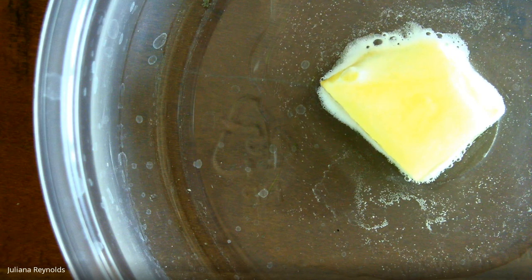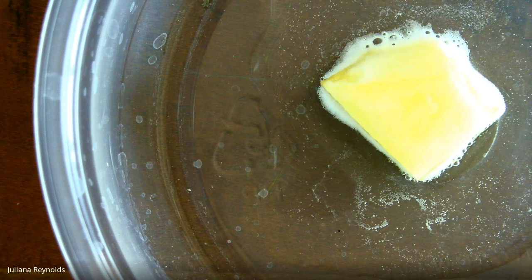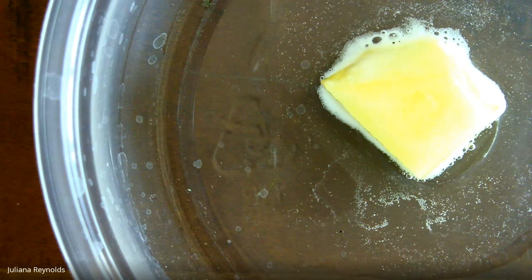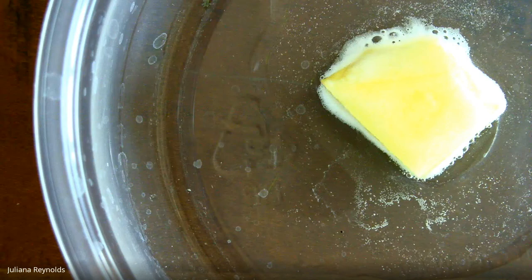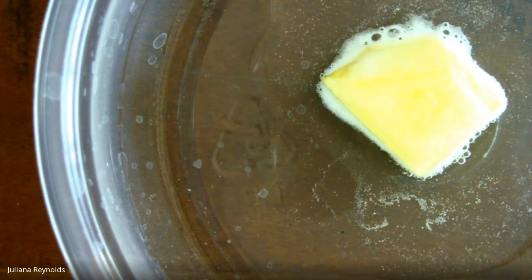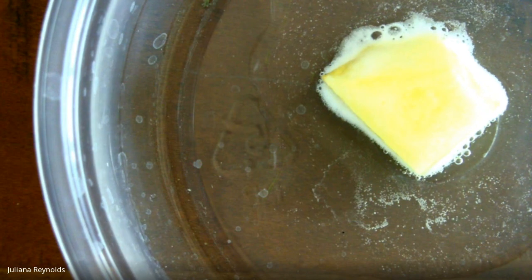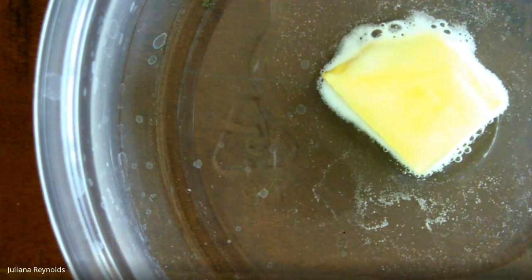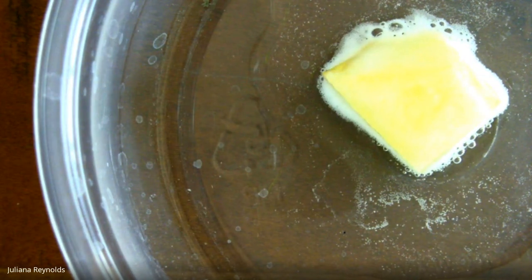Please take a moment and record your observations and draw your conclusions. Does anyone have any questions about the potato that's reacting with the hydrogen peroxide right now?